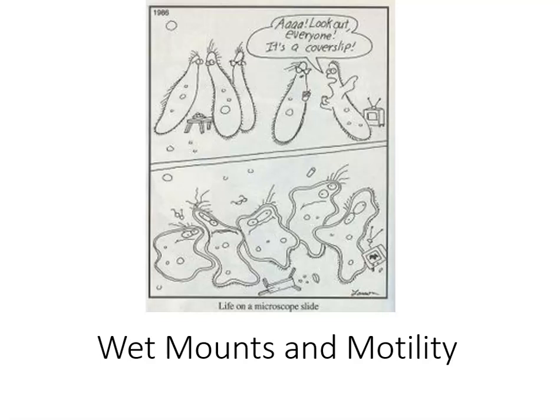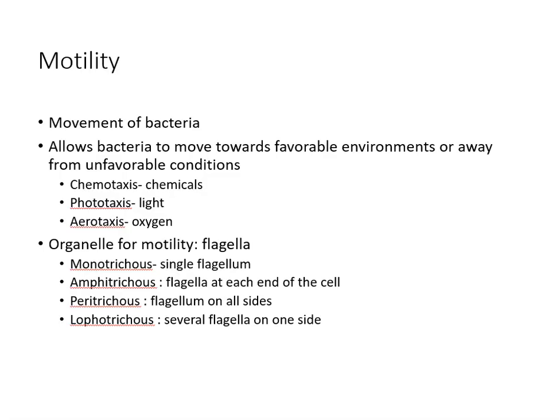Let's look at a way of looking at organisms and seeing how they move. You can see the lovely little guy. Here's a cover slip, and they get all smashed. So first of all, motility is the movement of a bacteria.